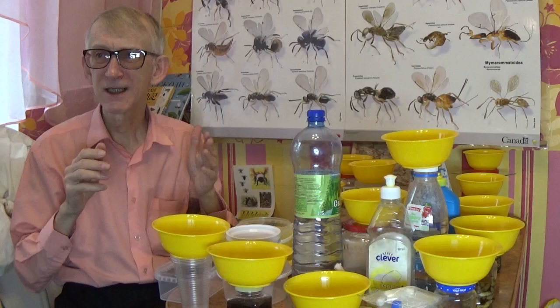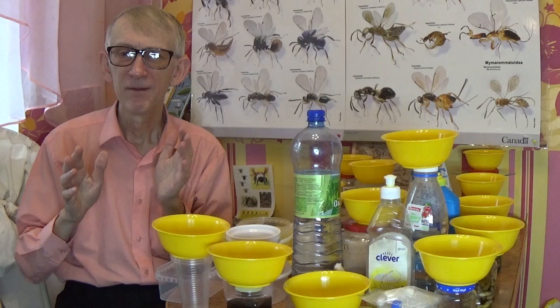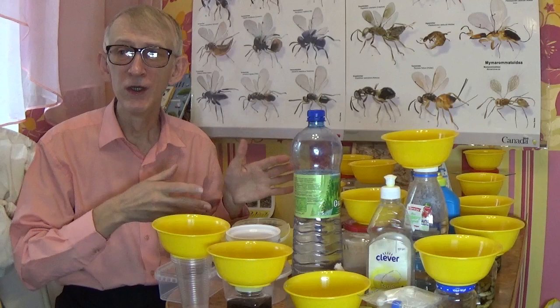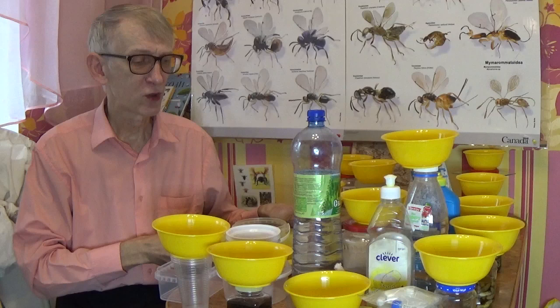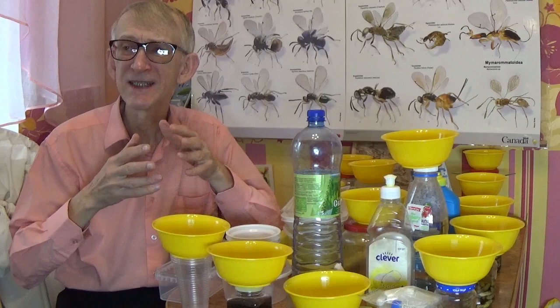When collecting with a sweeping net or butterfly net, you may have only some minutes and then need to sort immediately in the field. But the yellow pan trap will collect instead of you — you just come, take all the collected material, and bring it to a laboratory where you can sort it into different groups.